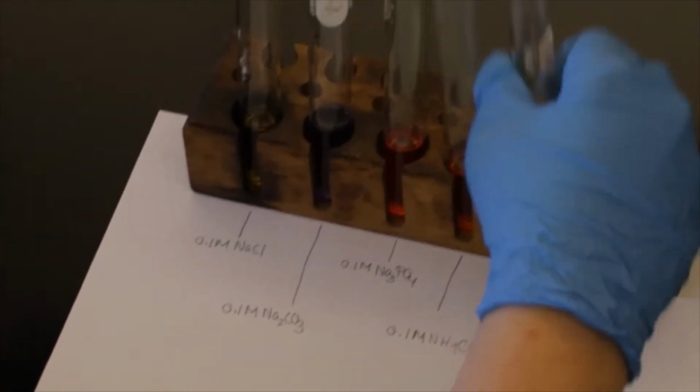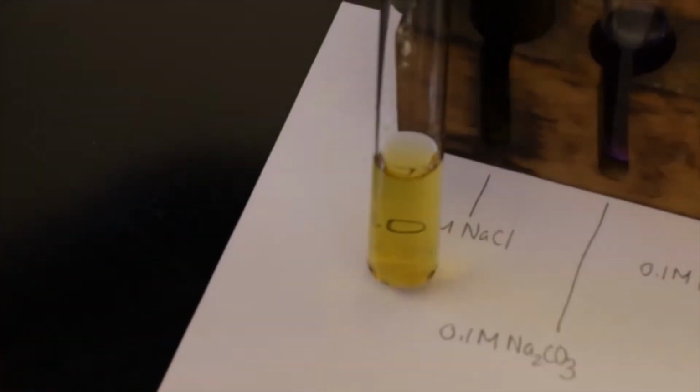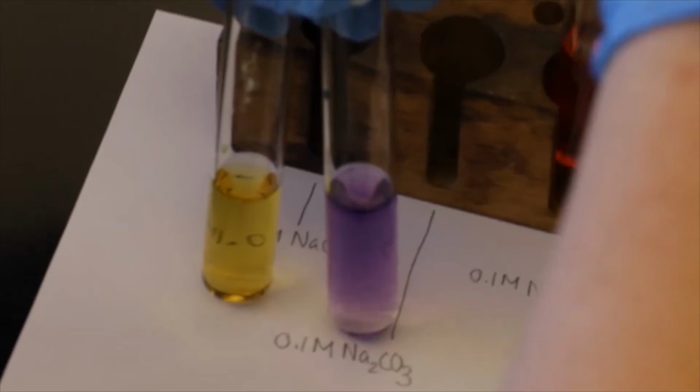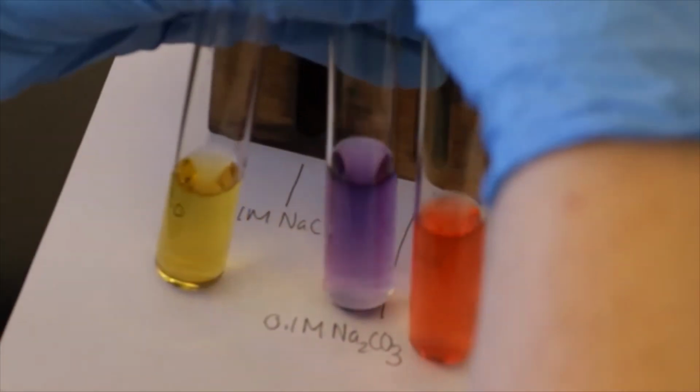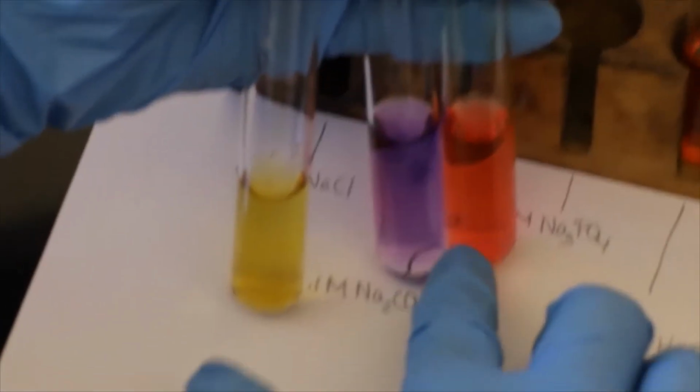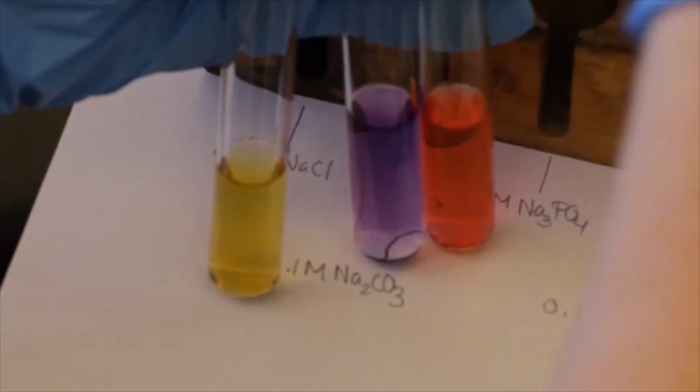We have that red. So we're going to review here. NaCl has this yellow color. When we added the green indicator, it turned yellow. Na2CO3 is purple. Na3PO4 is kind of this orangey red.